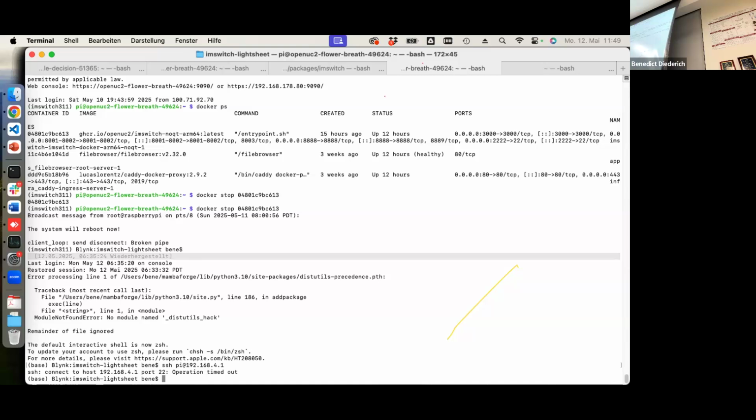So it's not actually blue, because at that small scale you can alter it, whatever. And the camera is actually just dark versus white. You just pick what you want. What's happening there is there's a scheduled light.